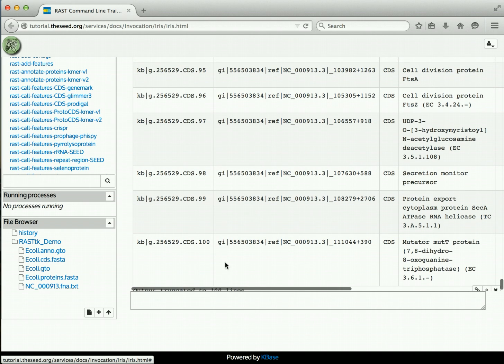So I'm going to show you how to get the different feature types. If we do that exact same command, we'll hit the up arrow key to get back to that. I'm going to create a pipe. That's the vertical bar character. And I'm going to pipe this output into a cut. And cut is a Unix command that will take an individual column. I'm asking for the third column, so it's actually the third field, so it's -f3.